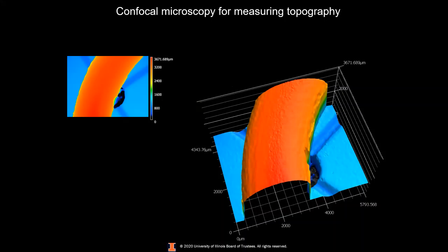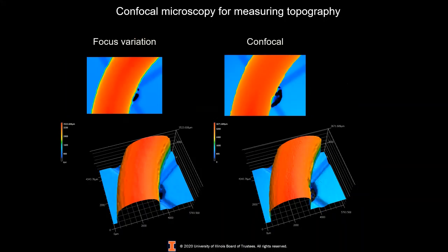If we compare the two, you can notice that the confocal has a clear gain in resolution. And note also that this example was done for a large sample with a low numerical aperture lens, which is not where you will see the most dramatic difference in resolution between these two methods. For much smaller samples, this difference will be even more evident.